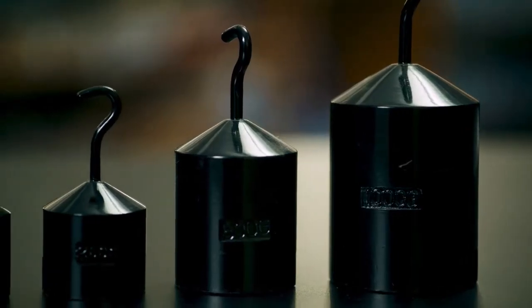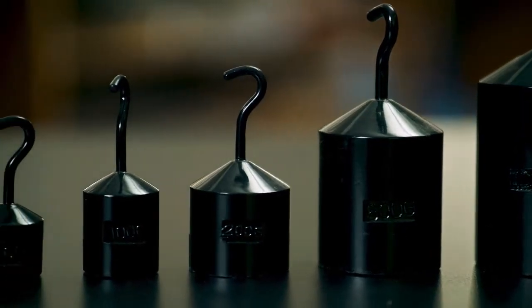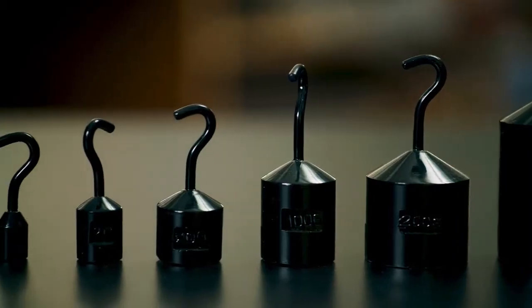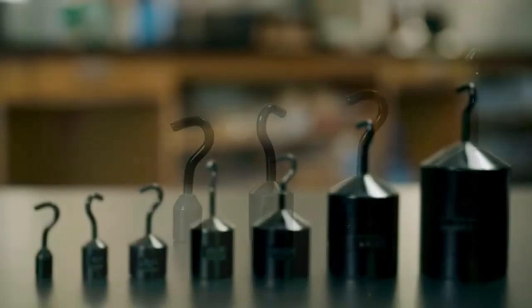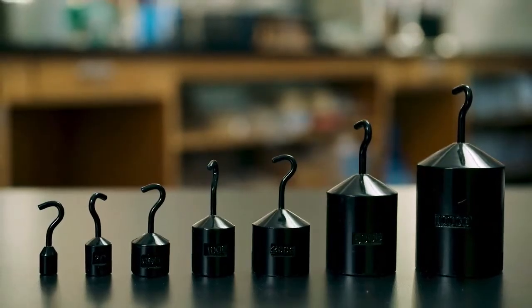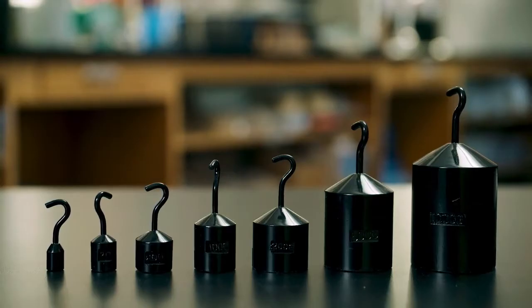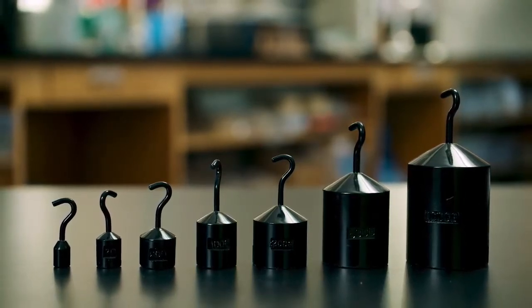Mass is a common measure used across all sciences and has vast applications in everyday life. Mass is a measurement of the amount of matter an object has. The base unit of measurement for mass is grams, and the standard unit is the kilogram. The gram base unit is often used with the metric prefixes milli, as in milligrams, or kilo, as in kilograms.